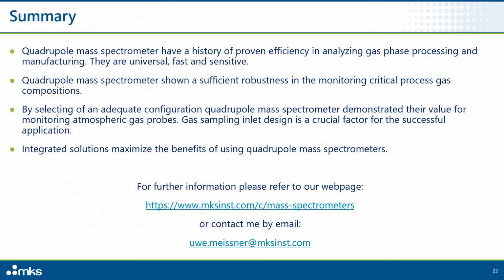So, I want to conclude my talk here. Quadrupole mass spectrometers have a history of proven efficiency in analyzing gas phase processing and manufacturing. They are universal, fast, and sensitive. Quadrupole mass spectrometers have also shown sufficient robustness in the monitoring of critical gas compositions.